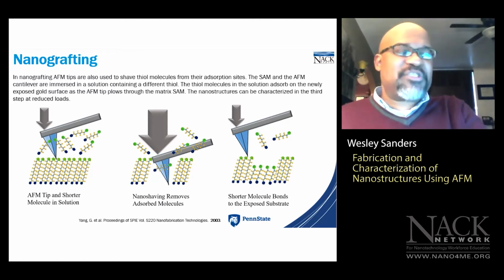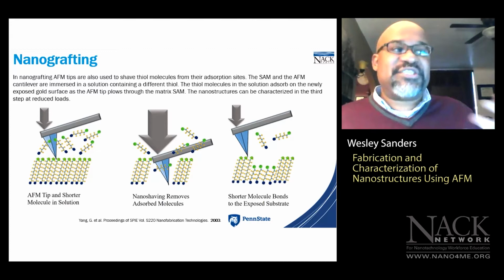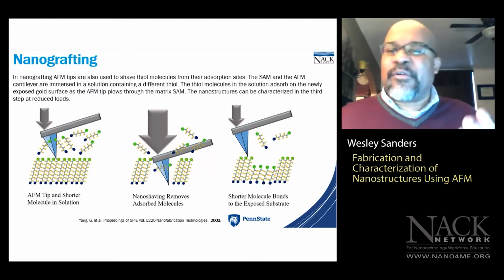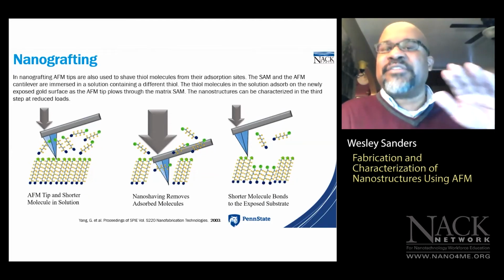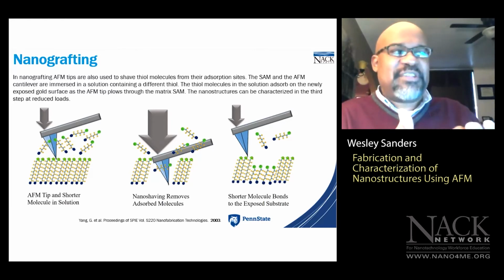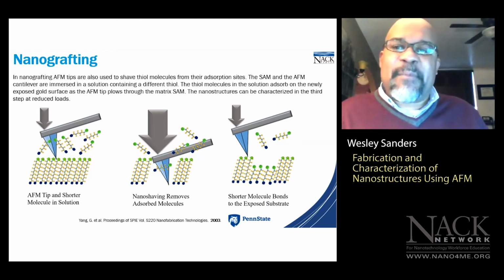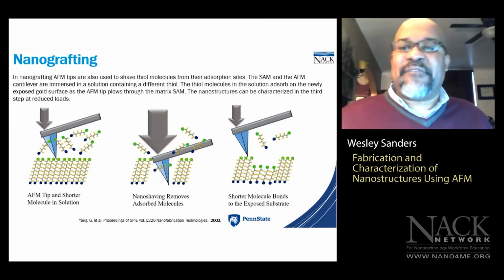So you would start with a methyl terminated self-assembled monolayer, because generally methyl terminated self-assembled monolayers are neutral, right? The only interactions you would observe with methyl terminated self-assembled monolayers are the van der Waals interactions that involve very short range distances. But in any event, let's say that you want specific regions in that monolayer to sense, let's say, glucose levels or urea levels to test for kidney function, right?